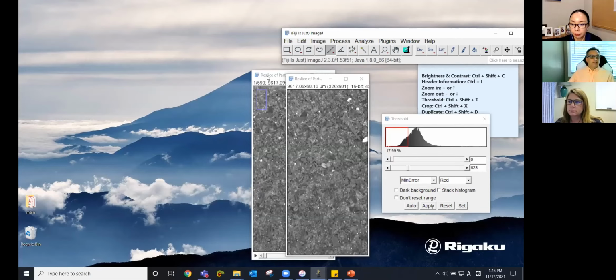Sarah asked, and this I'm not sure, what's the best way to subtract different scans of the same thing made during a time series to see changes? We may come back to this when you do your 4D CT. It might make more sense when we look at the next scan. I think it's a good question. We'll cover that one later.